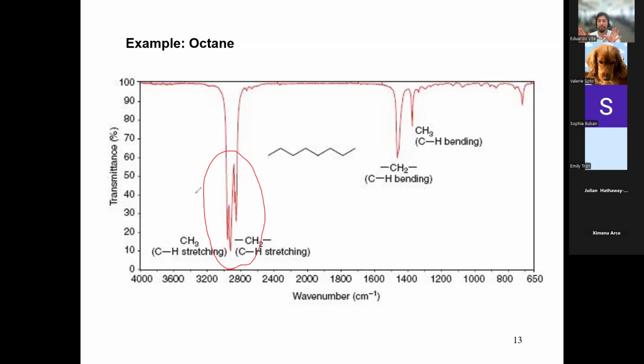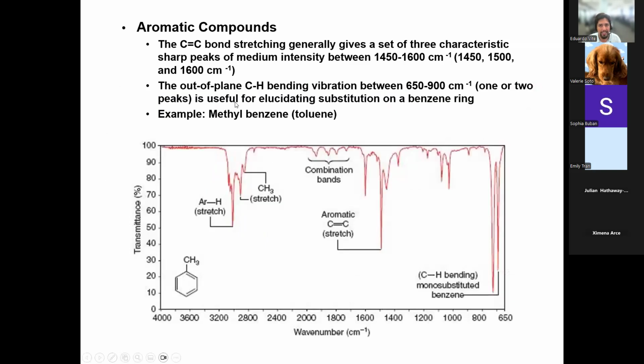And this is a simple molecule. There's nothing else attached to it. It's just this. So this is just one example. Now we're starting to make some sense of these squiggly lines. I think we have one more example. Yes, aromatic compounds, right? Are you familiar with this concept, aromaticity? Something that is aromatic. Have you heard that in lecture?